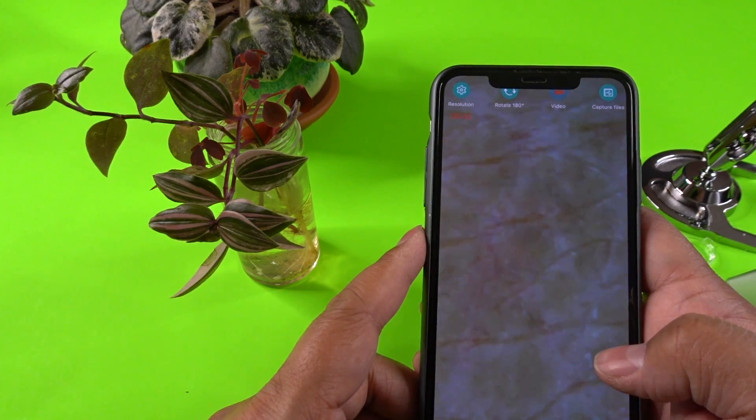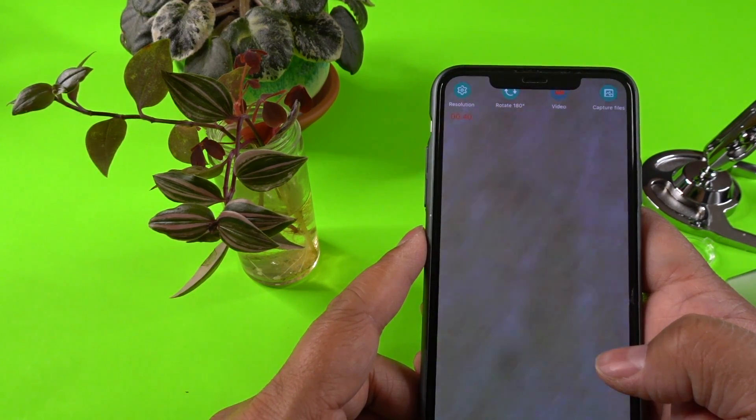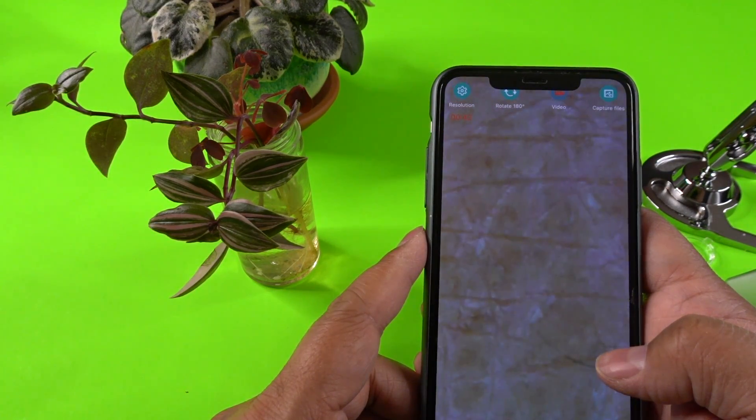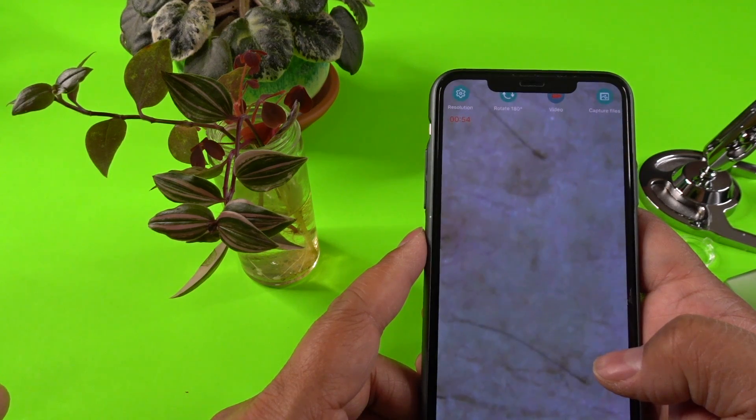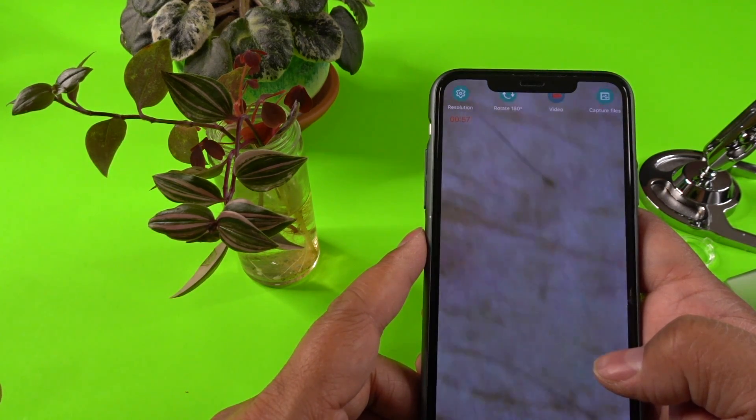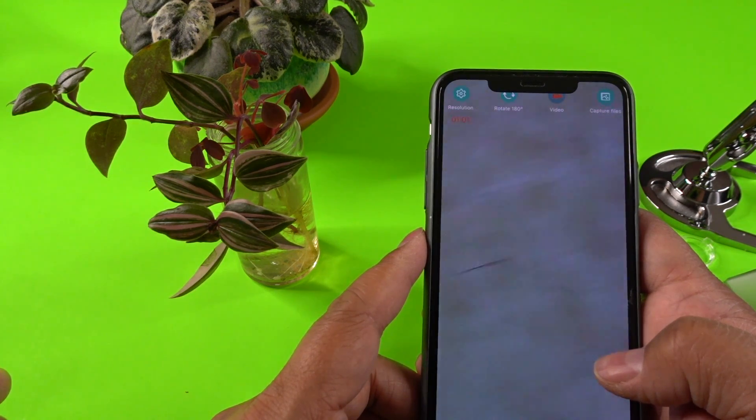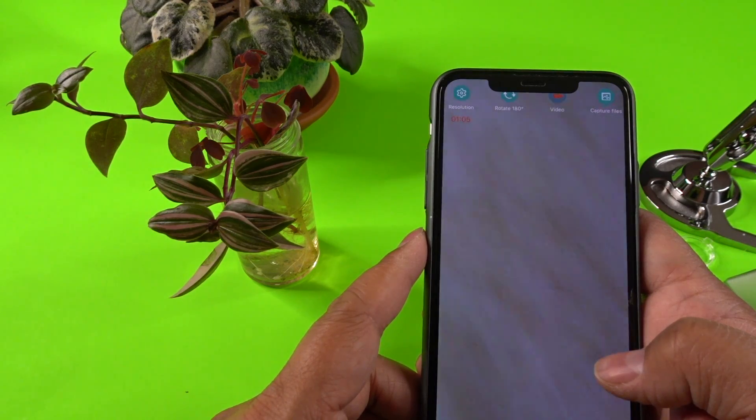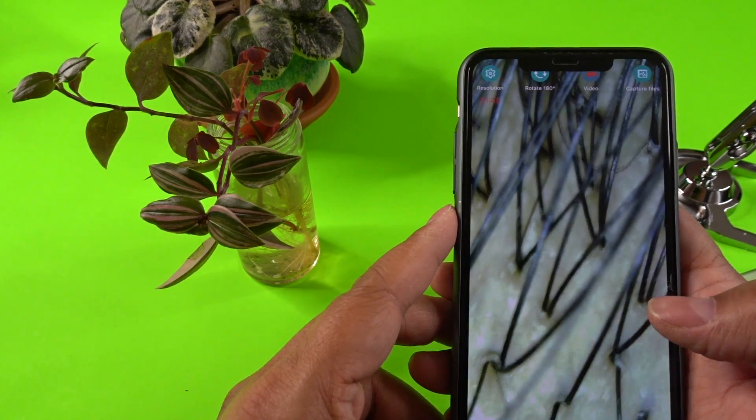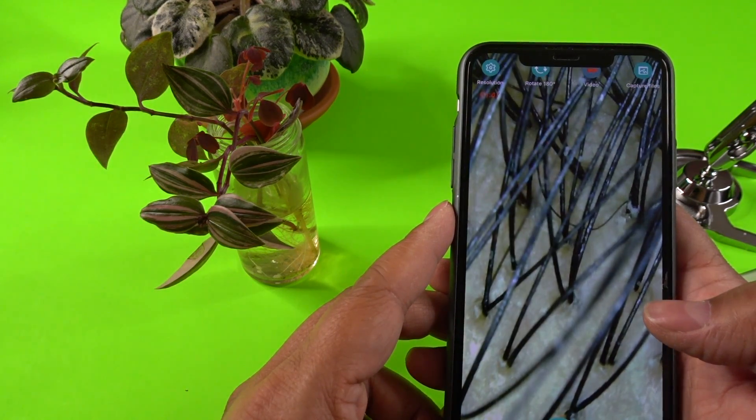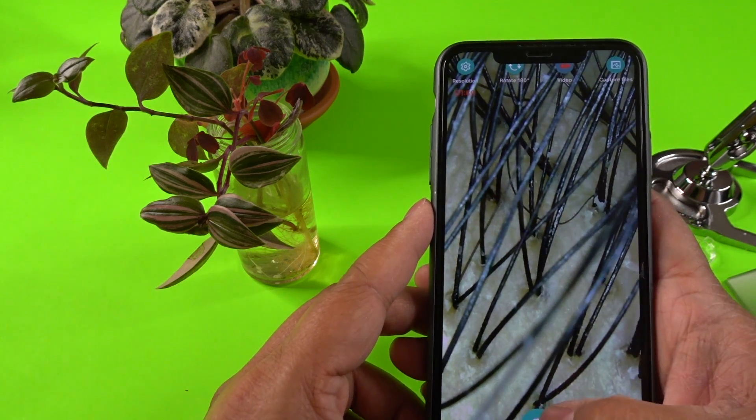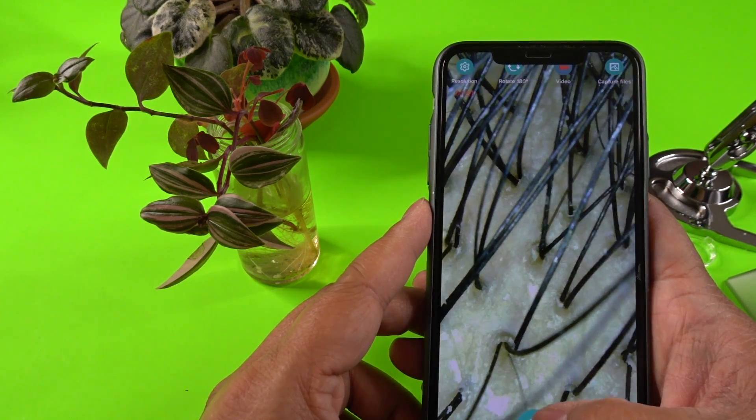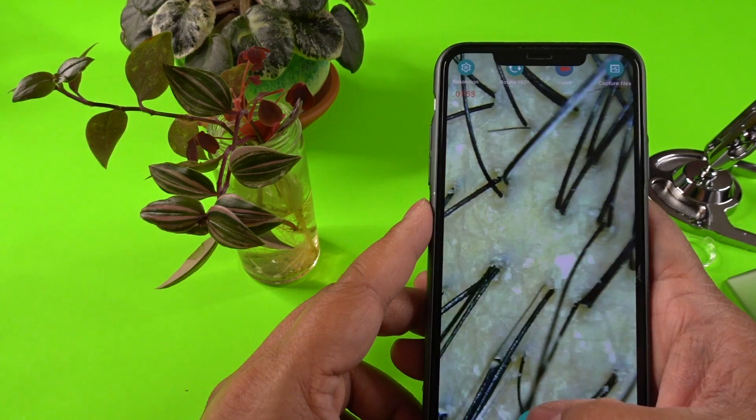And that's my skin. Look at that's my hand guys. Look at that. Oh look at that hair. And a lot of folks on YouTube who does beauty videos use these things to really show you up close their skin. Look at that. You can see like the very fine details of the hair on my hand. Wow look at that level of detail guys. Look at that. That's like a playing field. And I'm able to take a screenshot of it while I'm recording video.